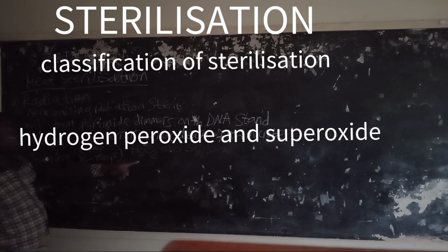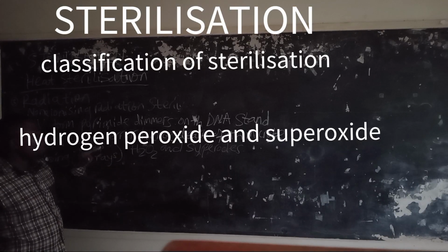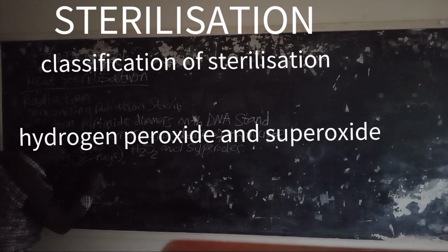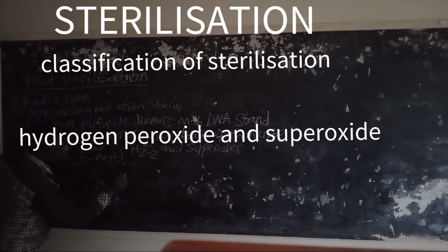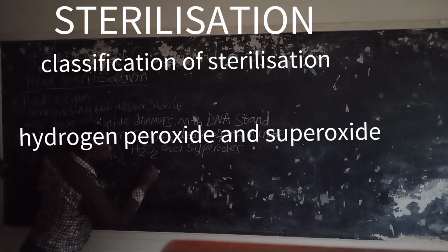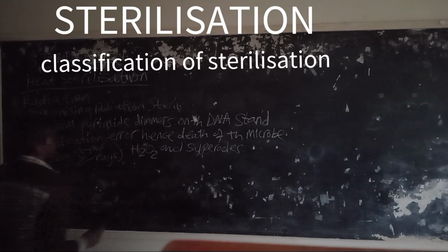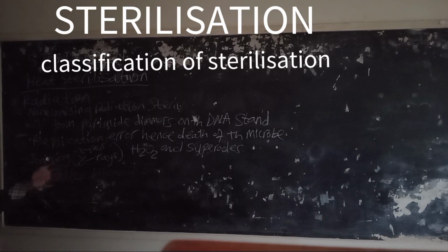These then oxidize the internal organelles of the microorganism, hence death of the microorganism. Sterilization has now taken place.